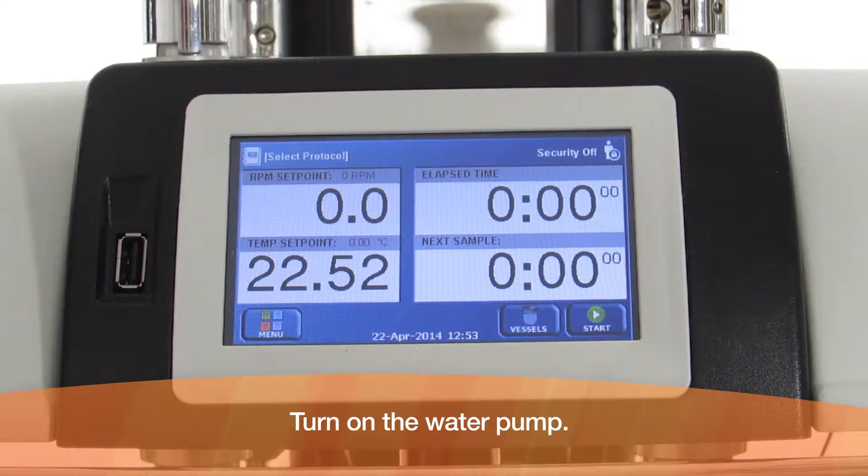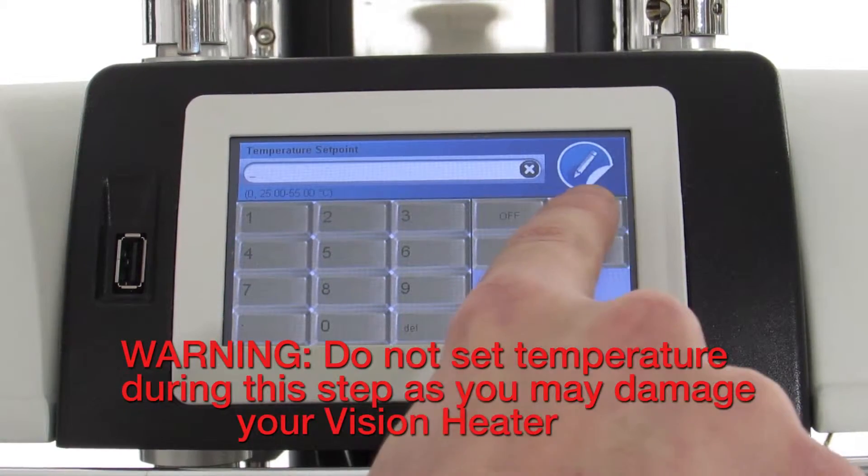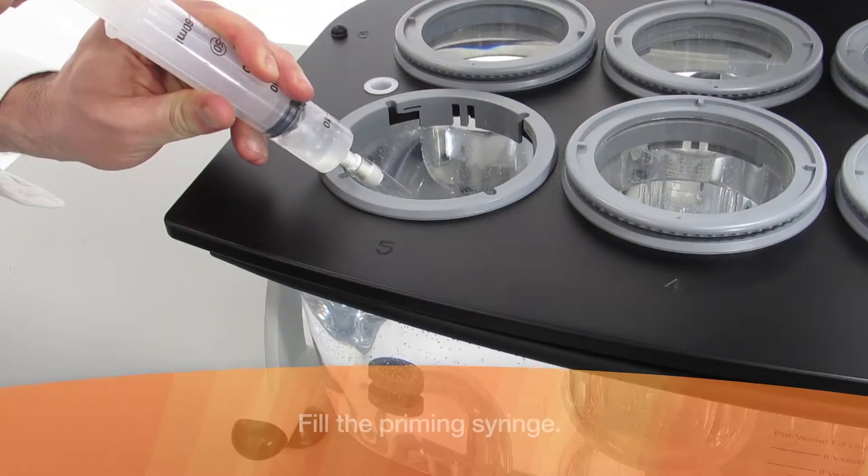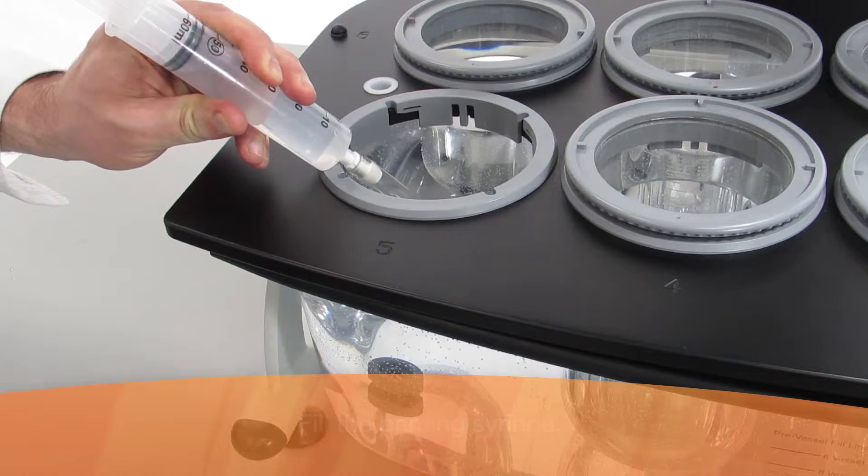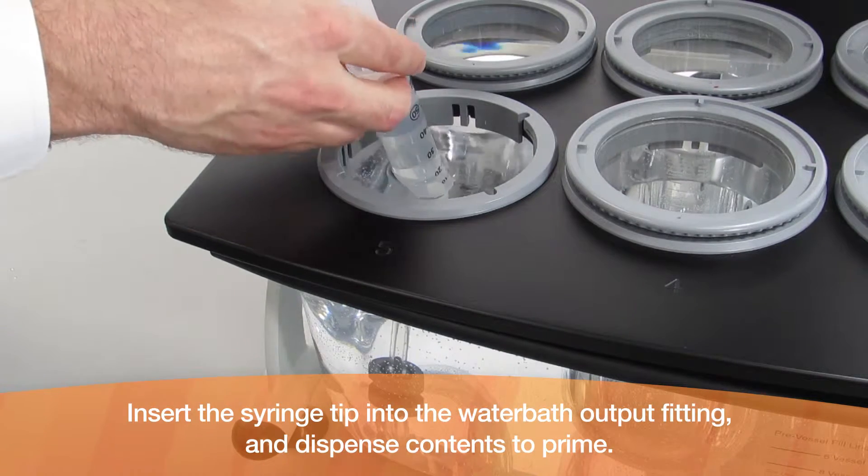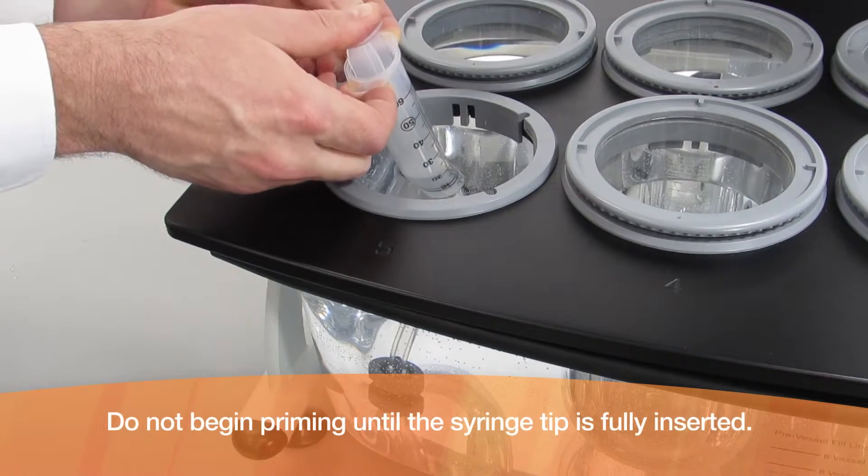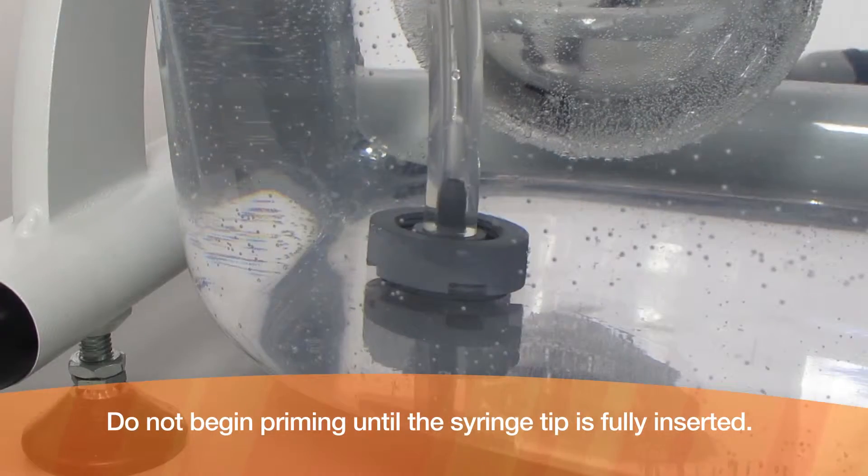Turn on the water pump. Fill the priming syringe. Insert the syringe tip into the water bath output fitting and dispense contents to prime. Do not begin priming until the syringe tip is fully inserted.